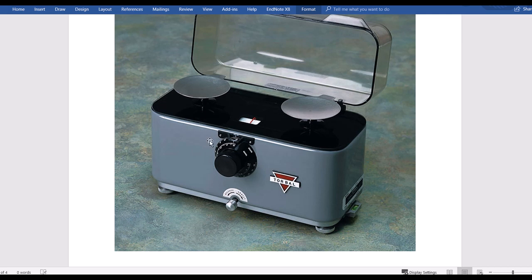And when the two products are of equal weight, these two balance pans will be exactly centered like a seesaw, and that red line right there will be in the center of that display window. And when it's off, or one side is too heavy, that red line is going to be left or right. So these are called a torsion balance. It's the mechanism inside, which is where that name comes from.